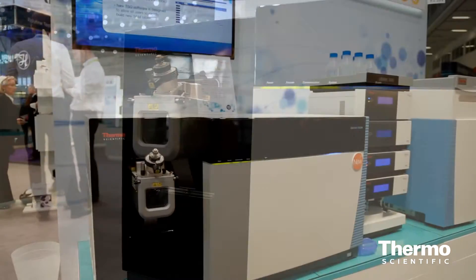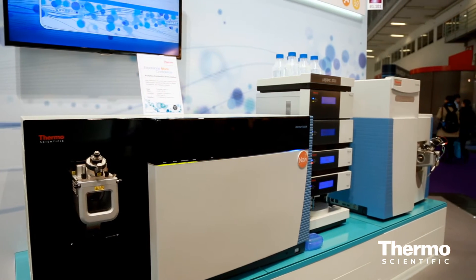I'm excited about the Orbitrap Fusion, which we launched at the American Society for Mass Spectrometry meeting last year, so it's not even 10 months old yet. What I'm excited about is the performance it delivers to our customers, but not just performance — it's actually quite easy to use, and we designed it that way.